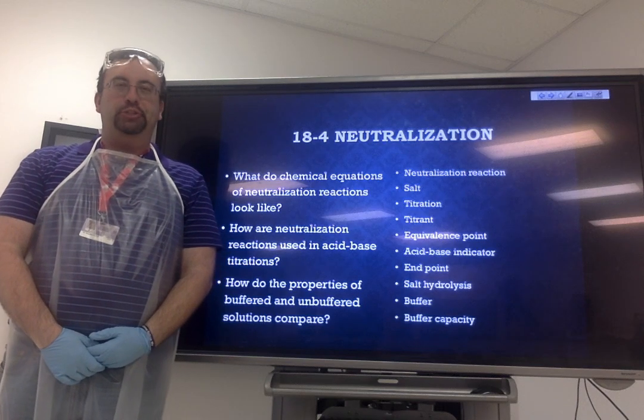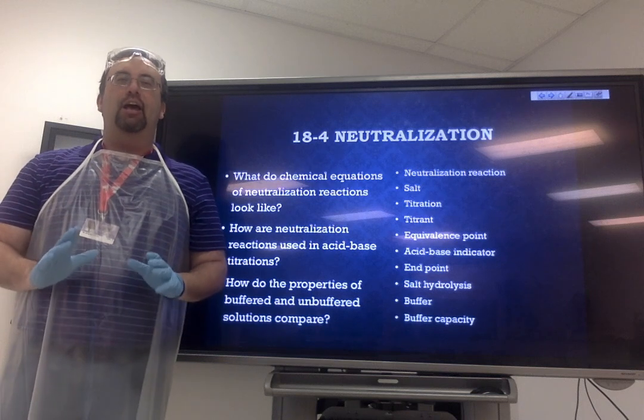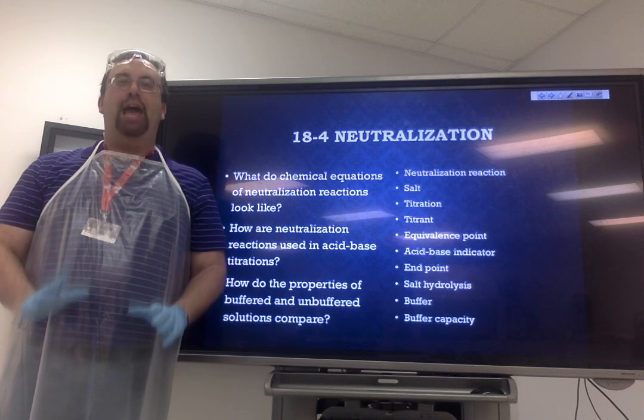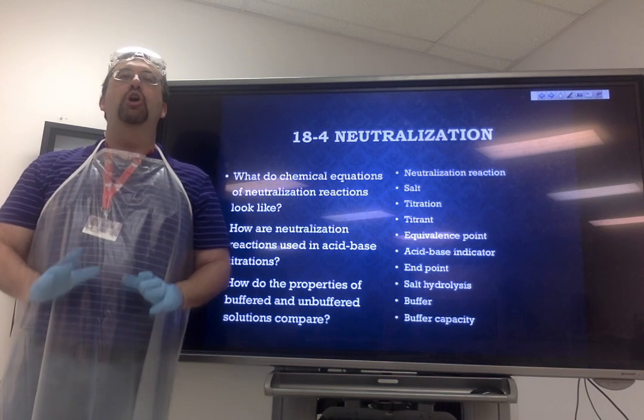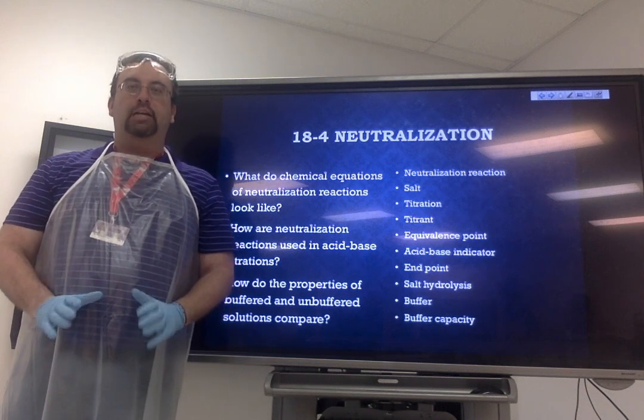Hello again, chemistry students. We're now up to our final topic of the year for chemistry. We're going to finish up the chapter on acids and bases today by looking at the process called neutralization. You may notice that I am dressed in my lab protective gear.